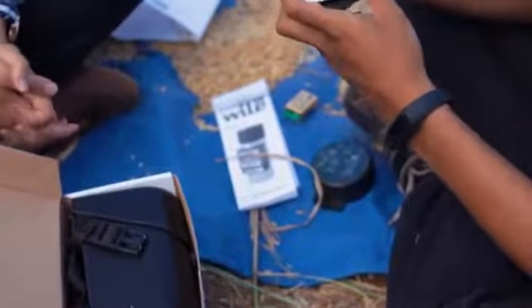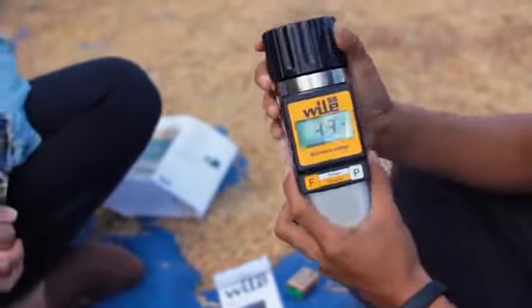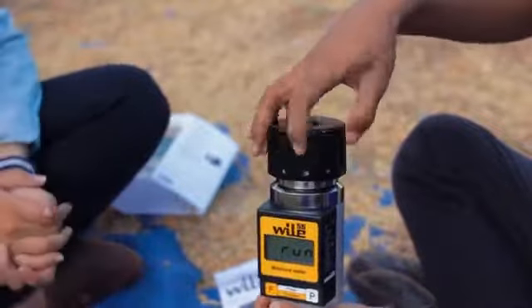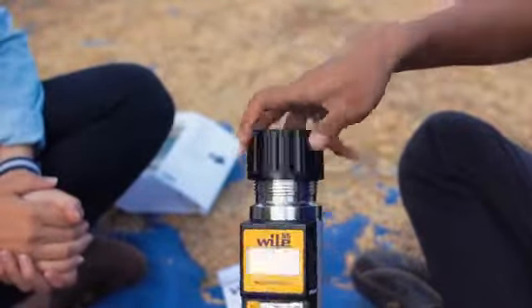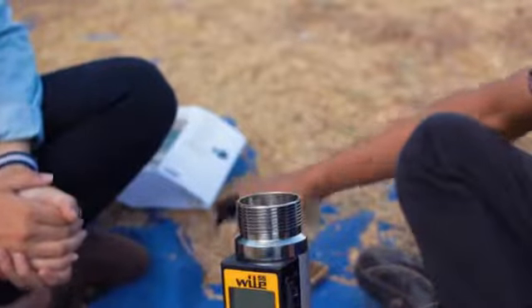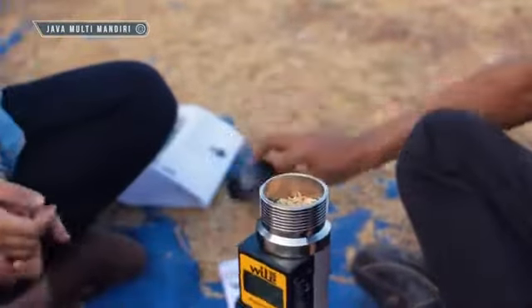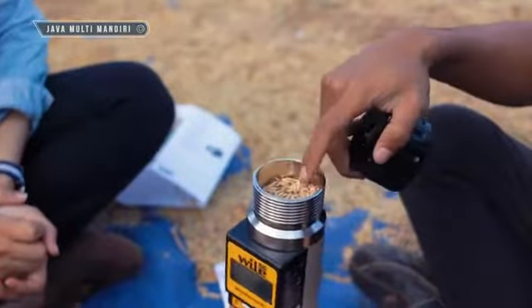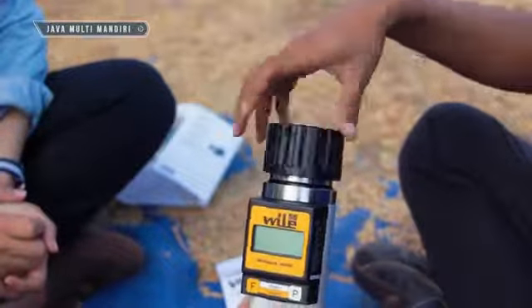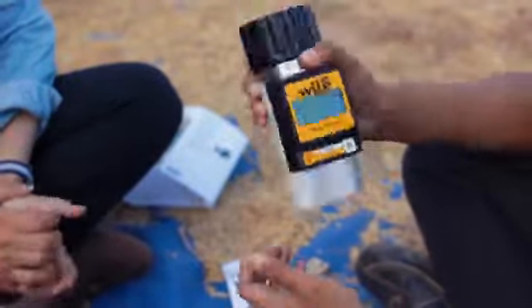Jika alat sudah terpasang baterainya, kemudian kita akan nyalakan alatnya. Kita akan masukkan biji gabah. Caranya seperti ini, menggunakan penutup ini. Isi jangan sampai penuh — isilah sampel satu per empat. Kemudian pasangkan tutupnya.